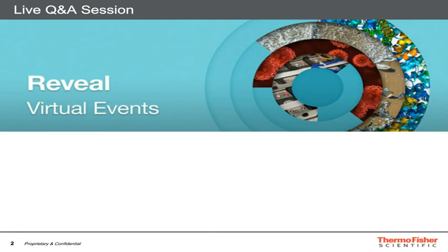the other way that I have seen used is using ultra-low angle microtomy, where you can do a very, very shallow cut across your stack, and then do imaging or line scans with XPS. But typically, I think you're better off doing depth profiling for that kind of range of thickness.